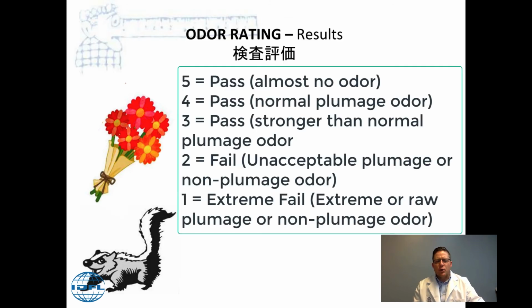The odor rating is just a general 1 to 5 scale. A 1 would be an extreme fail. That would smell like unwashed plumage directly out of the slaughterhouse, where it has been contaminated with a lot of other bacterial agents.